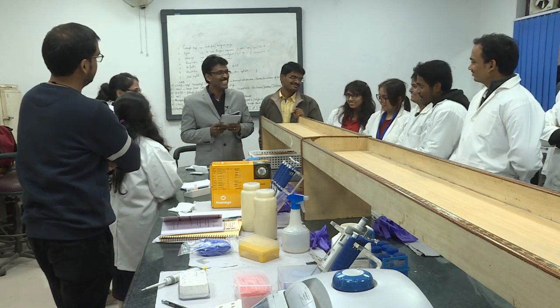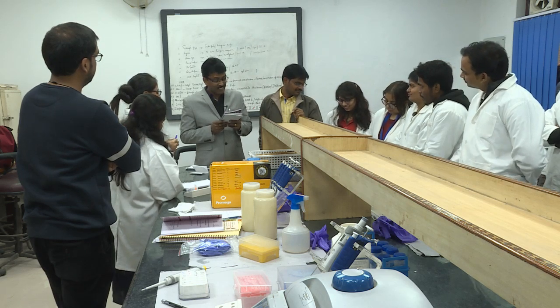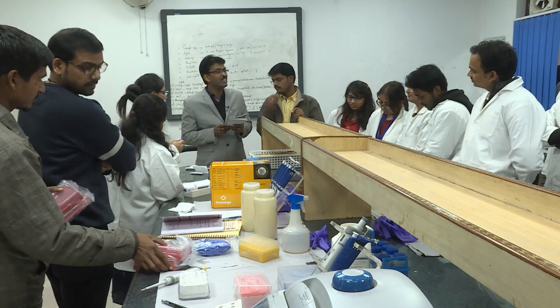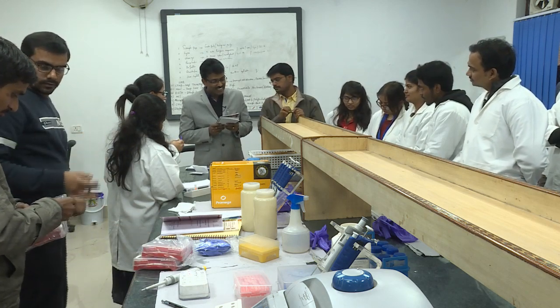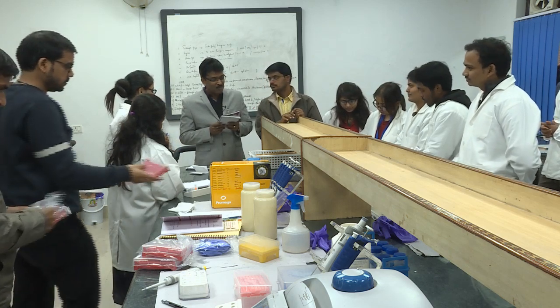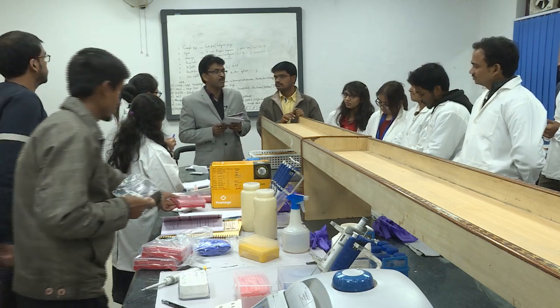Right? So let us accept it. And yield wise, not bad, it's good. One sample is 128.8 nanograms per microliter, and another sample is 93.3 nanograms per microliter. So the problem is with the second sample, which is 93.3 nanograms per microliter.